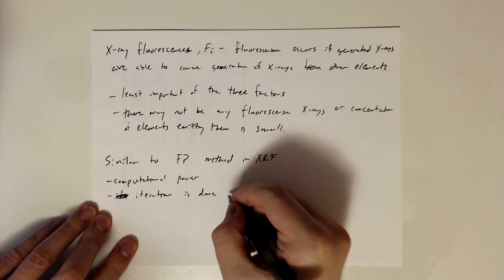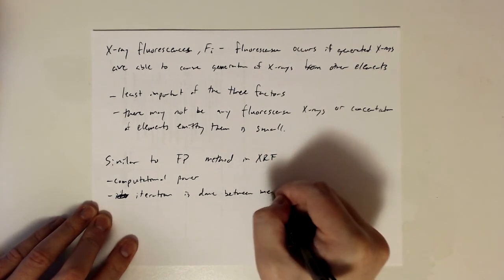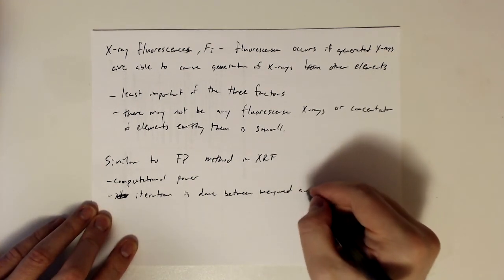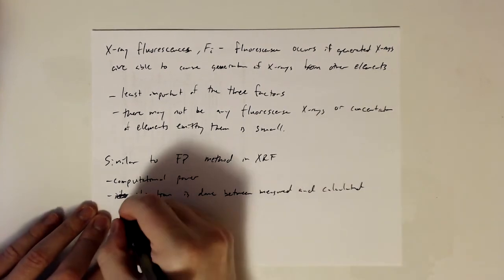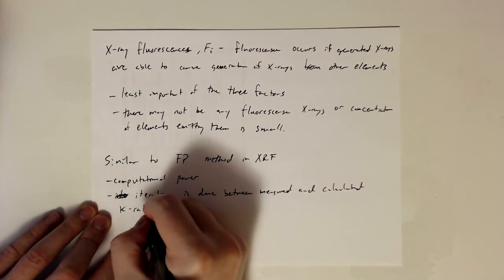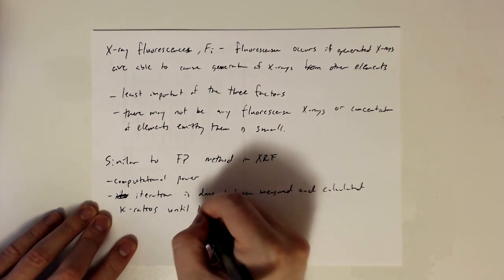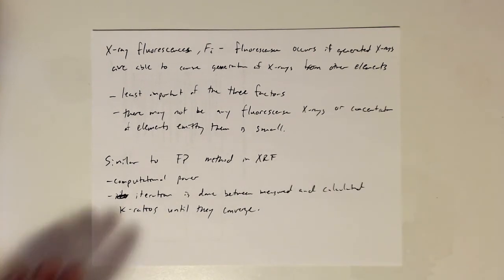And it's doing that between the measured and calculated K ratio, and it's doing that until they converge. So this is all done in a program.